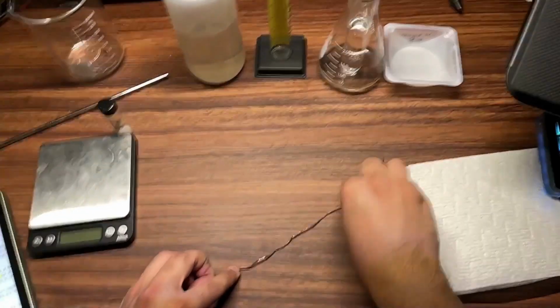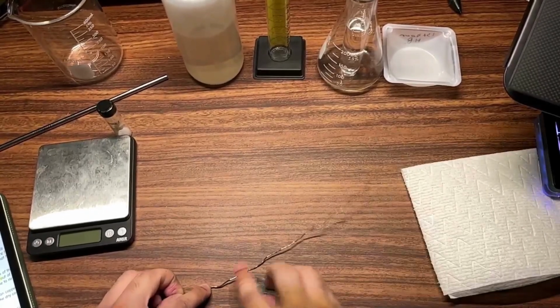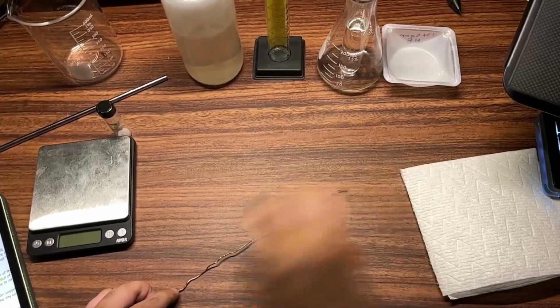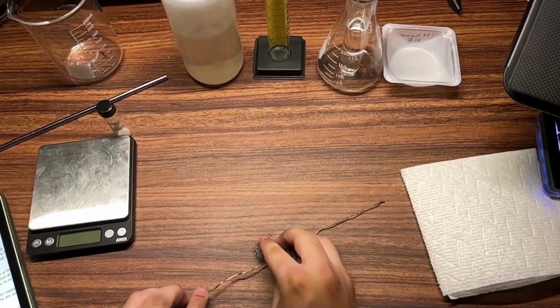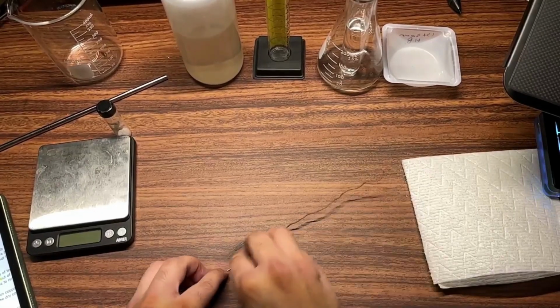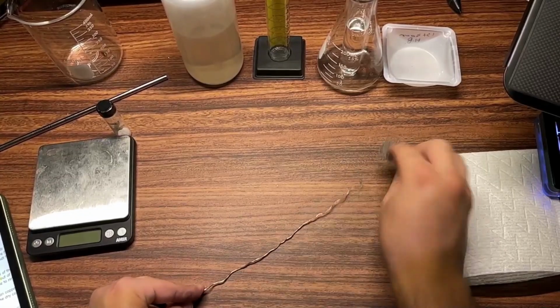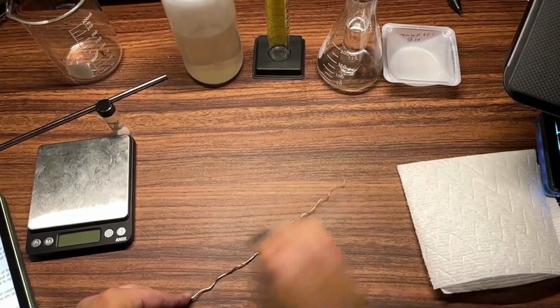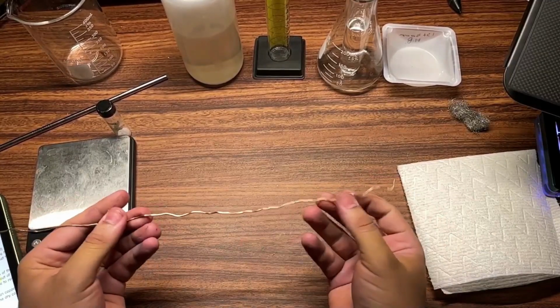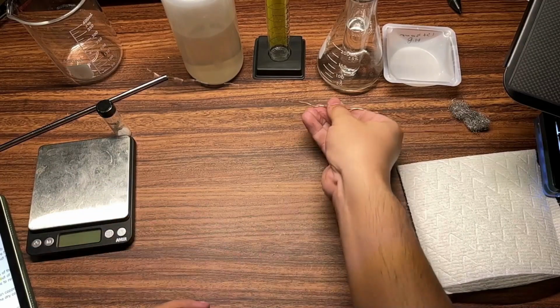And if I just swipe that steel wool over the wire, you can see already how it's getting shinier here. Because all I'm doing is stripping off the outer layer of this wire, just a really thin layer of oxidation, to reveal the nice, shiny, clean copper underneath. So that's step one. There we go. You can see how much nicer that is. Very shiny metal. And now I have pure copper here. There's no copper oxide on there.